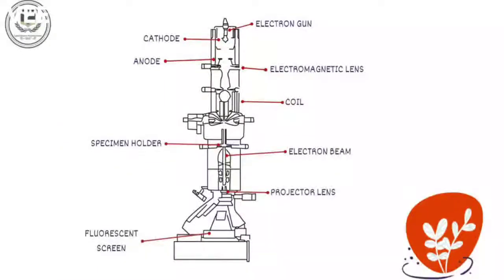Then there is the cathode and the anode. Electrons leave the cathode and shield, accelerate toward the anode, and pass through the center aperture with a constant energy if the high voltage is stabilized sufficiently. The electron gun's management and alignment are vital to its successful operation.